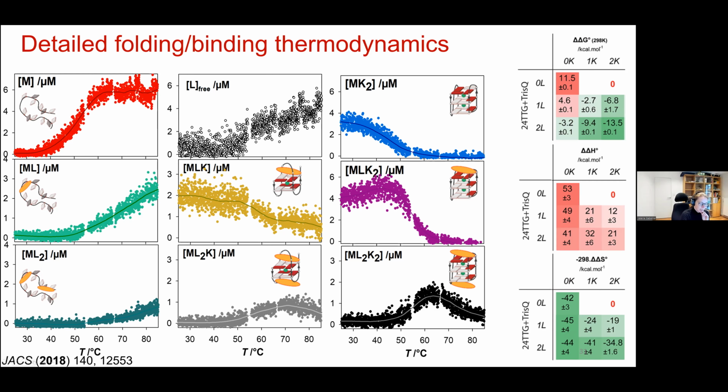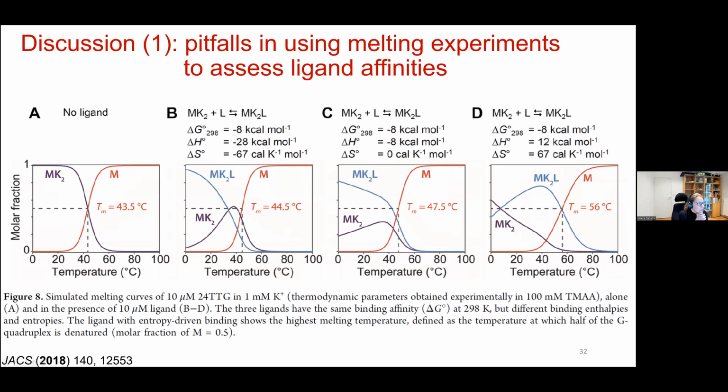So I encourage you, although the paper is maybe a bit long and complex, I wanted to also highlight a couple of points in the discussion section of the paper, because I think it has important implications beyond mass spectrometry, for any interpretation of melting experiments. Here, at the same time, we have temperature dependence, but we measure the equilibria directly for each of the temperatures. And it allows us to reconcile some observations that could be discrepancies between a melting assay and an isothermal assay.